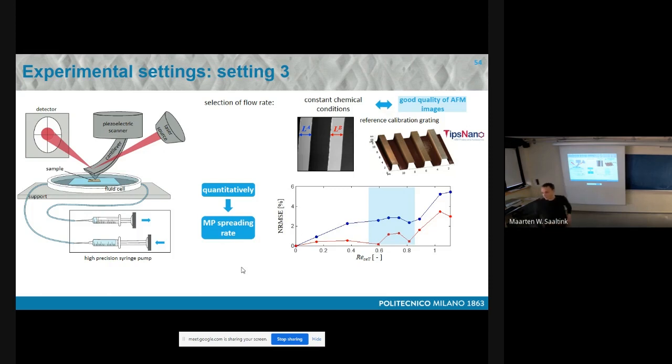Yeah, how do you describe it? So we were able to find some relationship between the evolution in time of the correlation scale of the indicator function and the average speed of the spread of the edge pits. We saw that there is some correlation. Now, how to explain it exactly? Well, we are still not there, to tell you the truth. And the other point is to, as Jordi said, do the same thing at different saturations. Yes, so how it changes as you go from equilibrium.